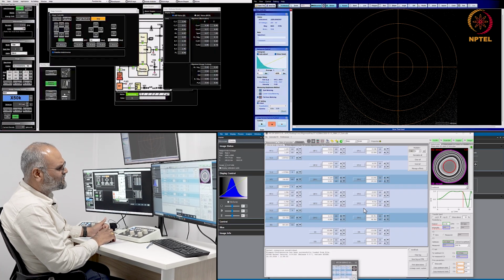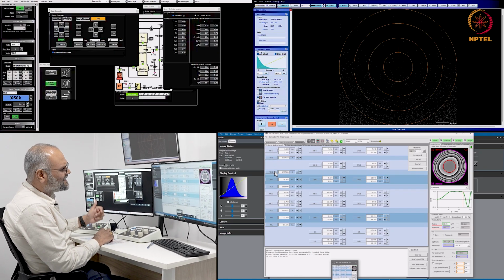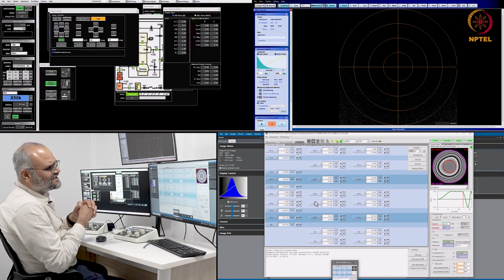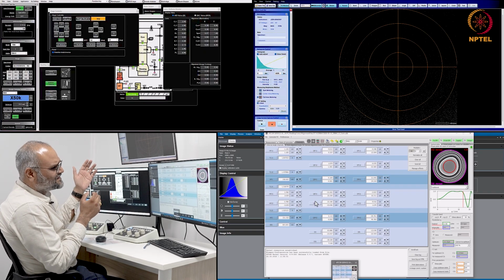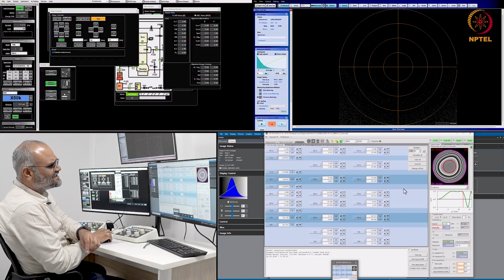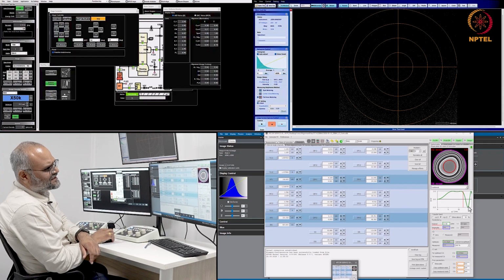Essentially, what the software does is by setting different values to the hexapole, the transfer lens, and the quadrupole lenses, you are creating a negative CS kind of condition, and the objective lens already has some positive CS value. By compensating for this, you are trying to obtain the ideal contrast transfer function.